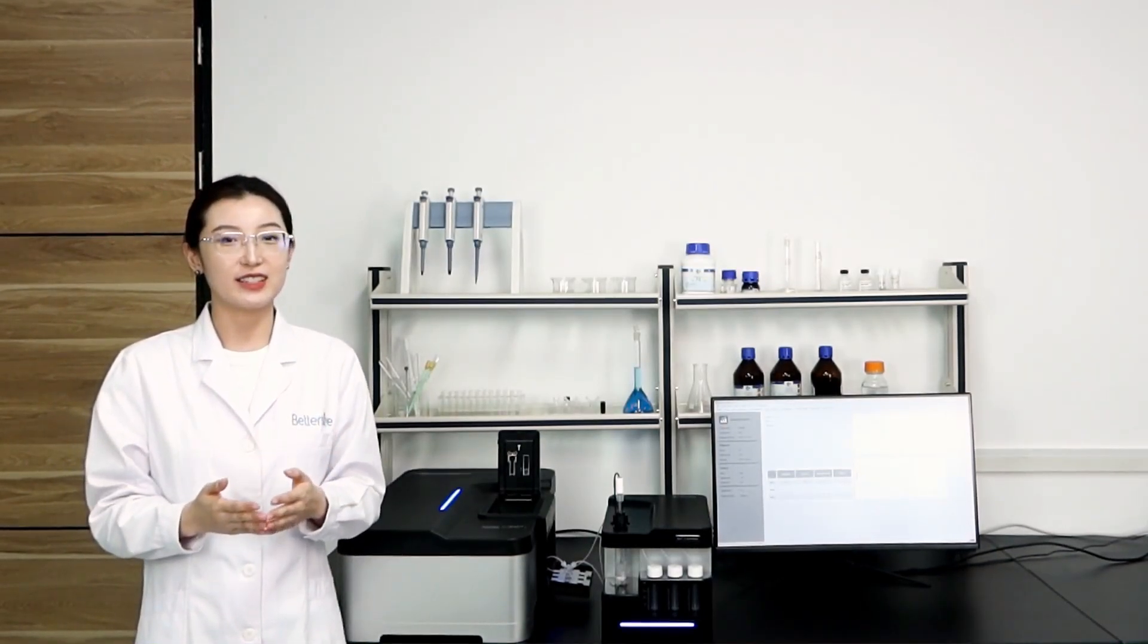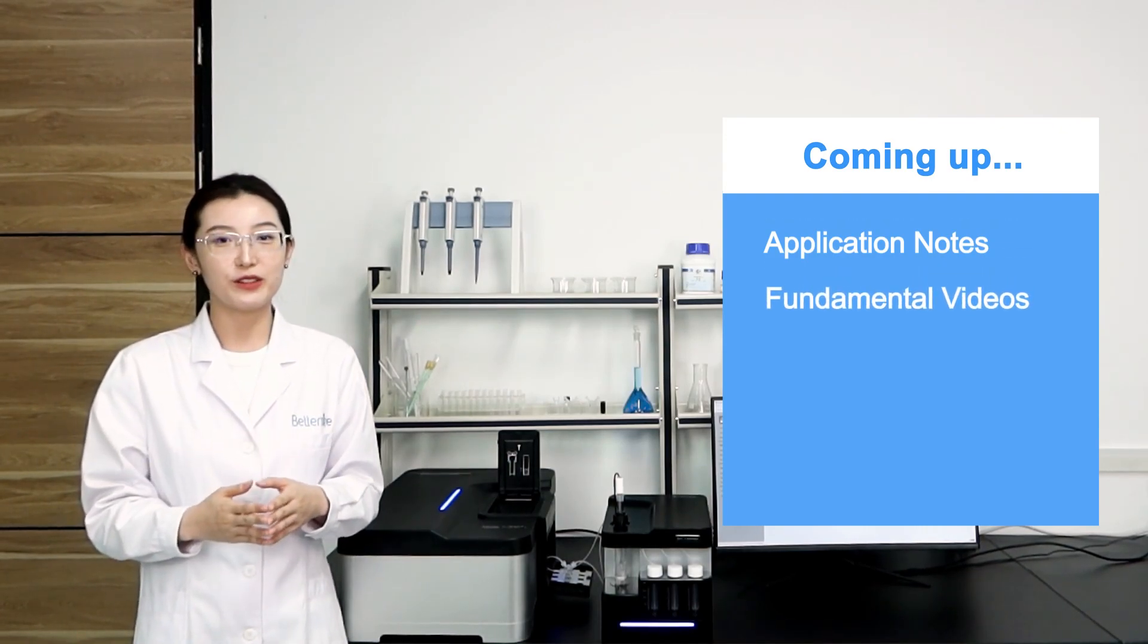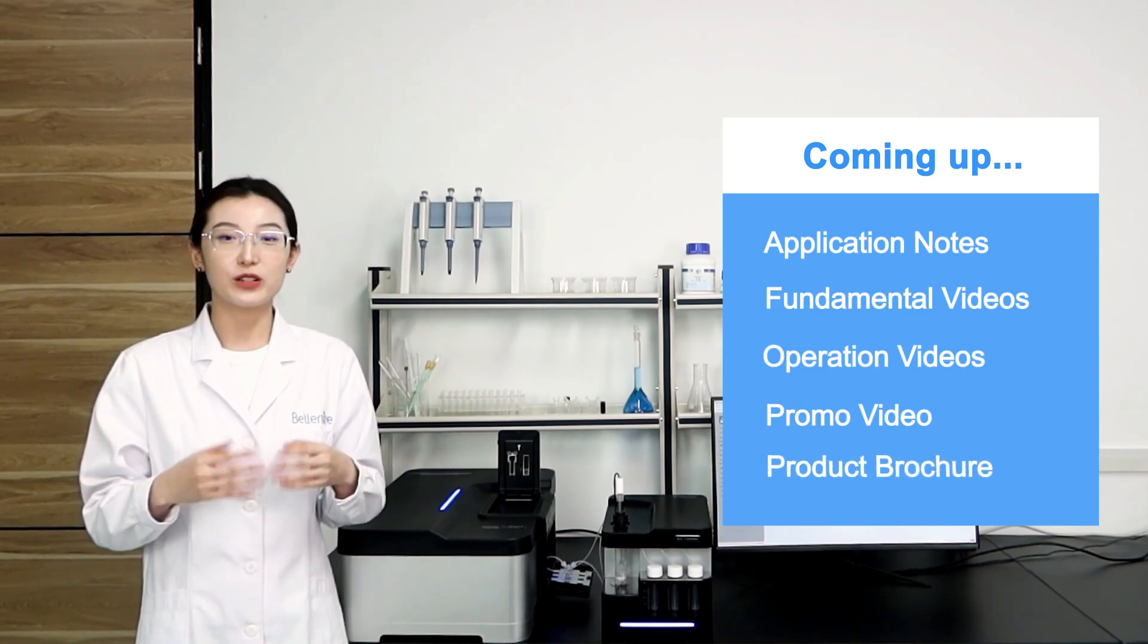In the following few weeks, we will bring a package of resources. These will include six application notes, two fundamental videos, two operation videos, one promo video, and a product brochure.